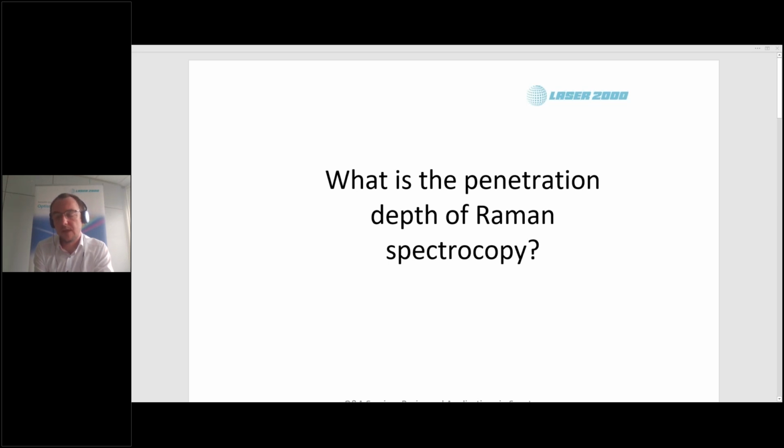optics you use. It can range from a very tight focusing lens or microscope objective, where you can have a small sample. When you go confocal, you can go nearly to a very, very thin disc.